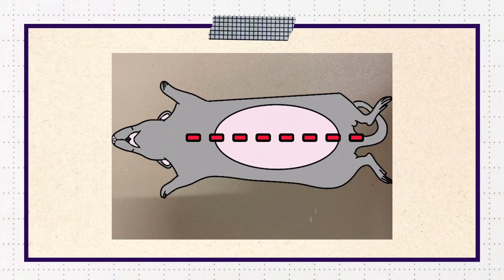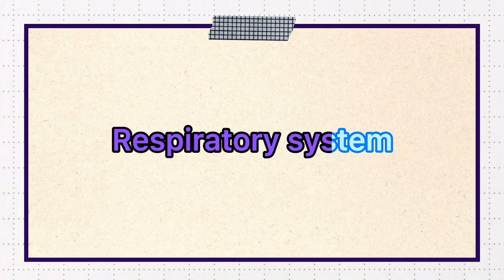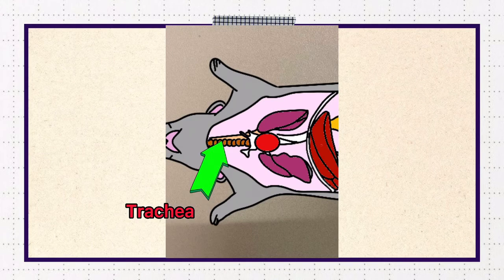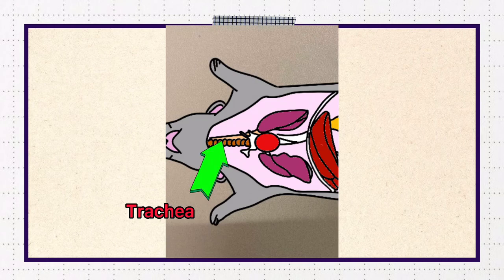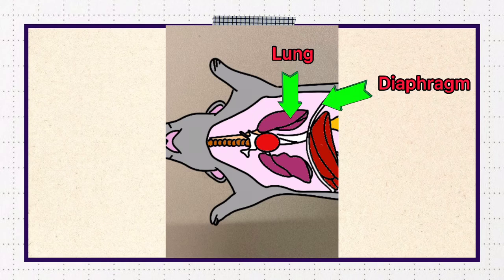After that, we carefully removed the skin and muscles of the rat to expose the organs beneath. Now let's take a look at the respiratory system. There is the trachea, which is the passage for air to pass to the lungs. The trachea is a tube that extends from the neck to the chest, and is wide and lined with cartilage. There are also lungs and a diaphragm, which are also important organs for breathing.